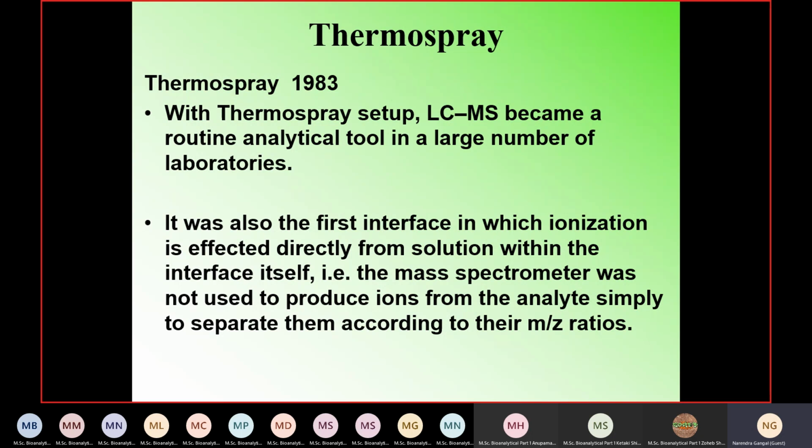Now, let us suppose I have got 1 ml of water vapor. Now I am just comparing the GC portion with the LC portion. When the GC is there, I am introducing a gas, and that gas is going through the mass spectrometer. It is 1 ml means 1 ml. There is no further increase in the gas volume.